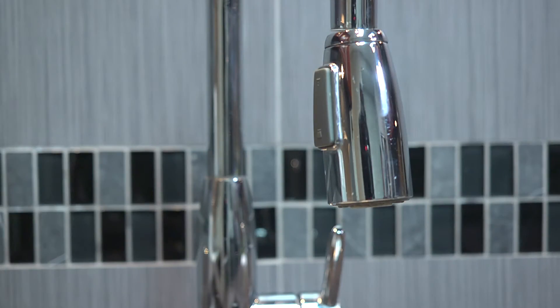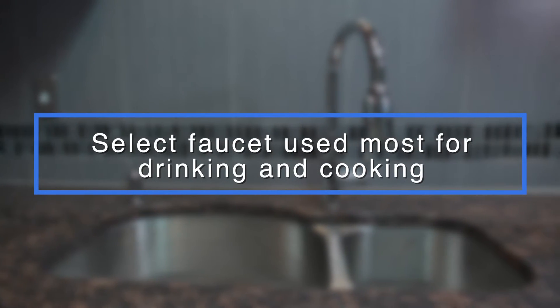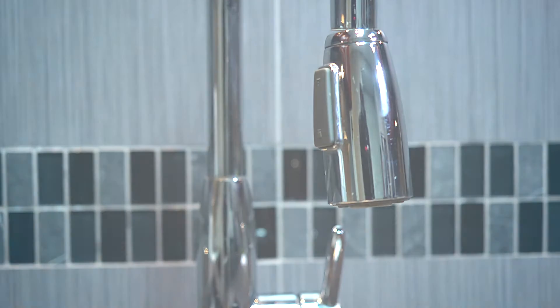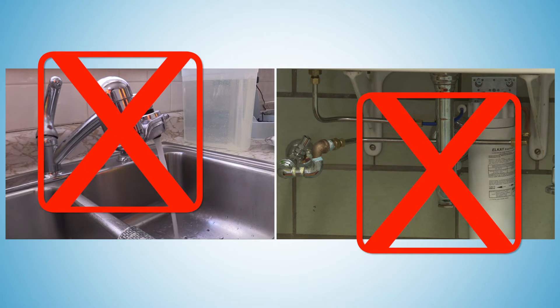Before you collect your water samples, select the faucet in your home you most often use for drinking and cooking. For most, that's the kitchen faucet. Make sure there's no water filter on the faucet or under the sink, and do not use a faucet connected to any type of home water treatment system.